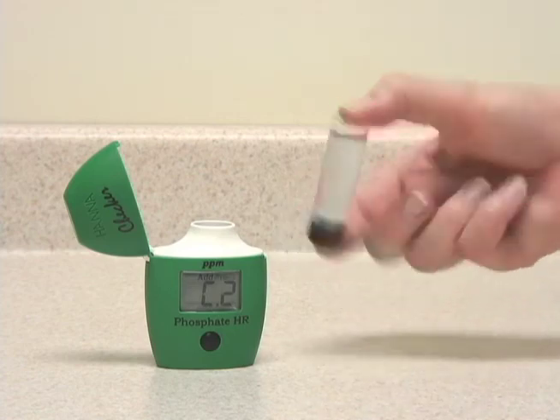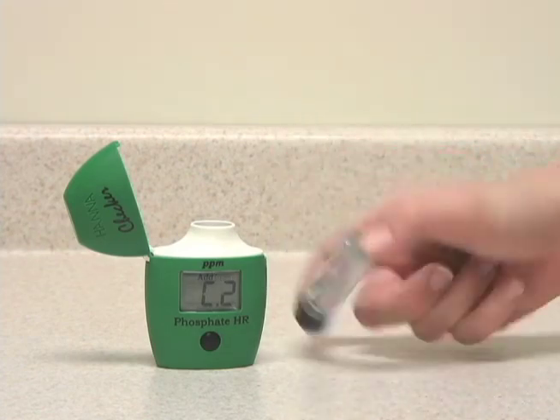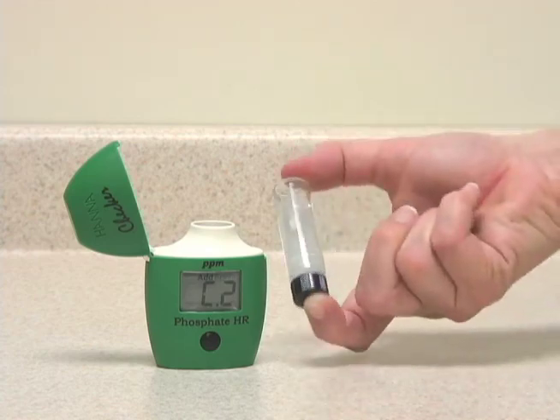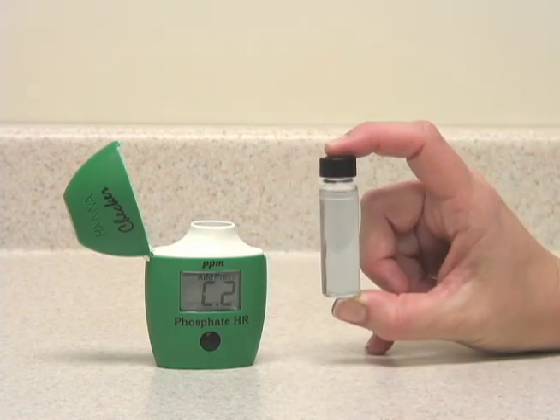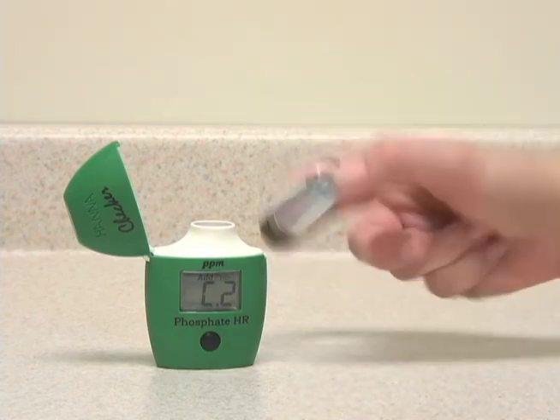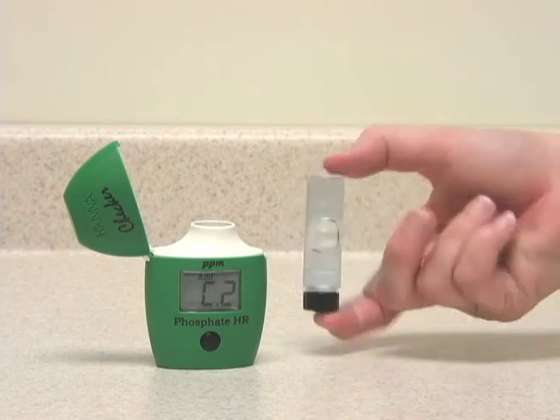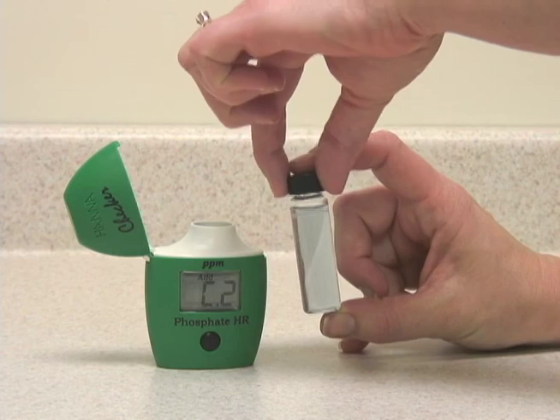Now we'll take the cuvette and shake gently until the reagent is dissolved. The reagent is dissolved.